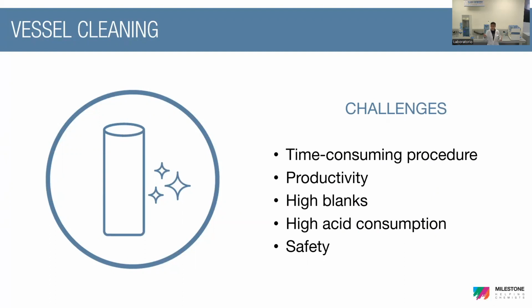If we think about soaking, the EPA usually suggests something around 8 to 12 hours of soaking, so it's a very long procedure. It has a high consumption of acids, so the level of waste generated is very high.